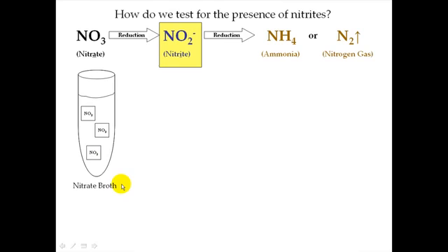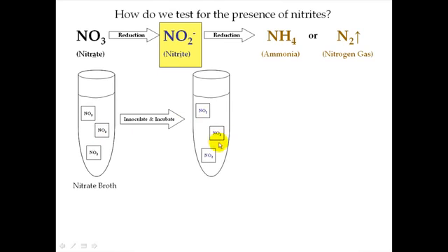After you incubate this tube, if the bacteria that you put into that tube were able to reduce the nitrates to form nitrites, the way you'd be able to visualize that is that after this incubation period, you add, again, stuff that basically serves as nitrite detectors. And the chemicals that serve as nitrite detectors are sulfanilic acid and alpha-naphthylamine. So you're going to be asked to add these chemicals to your nitrate tube after the incubation period. And again, these things function as nitrite detectors.